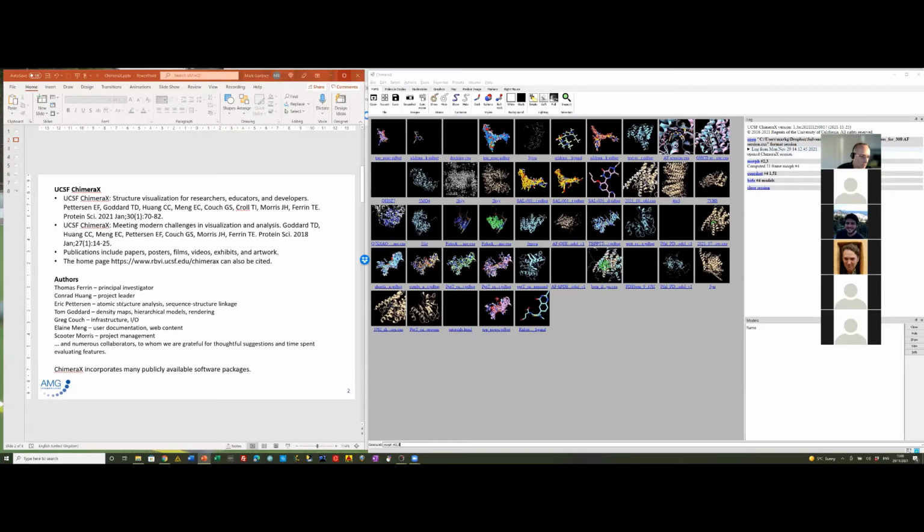As you can see, quite a few people have been involved in the development, and you may well know that it comes after Chimera, which they say is not being developed further. ChimeraX is the latest version and is actively being developed. There are probably a few things in Chimera that haven't made it into ChimeraX yet. There are definitely also some new features in ChimeraX, things like the interface with AlphaFold.